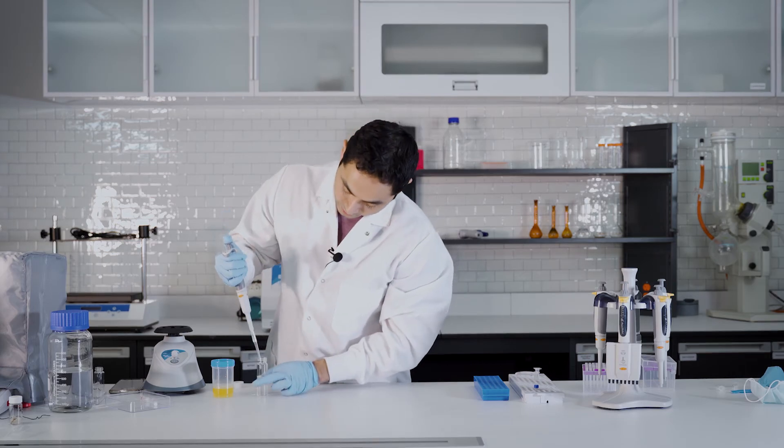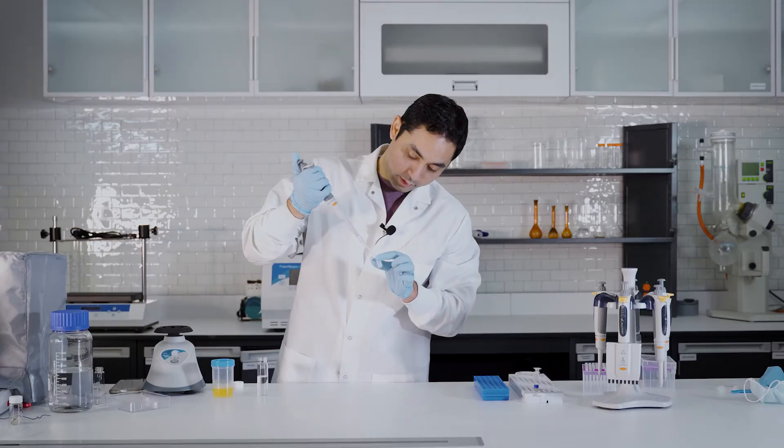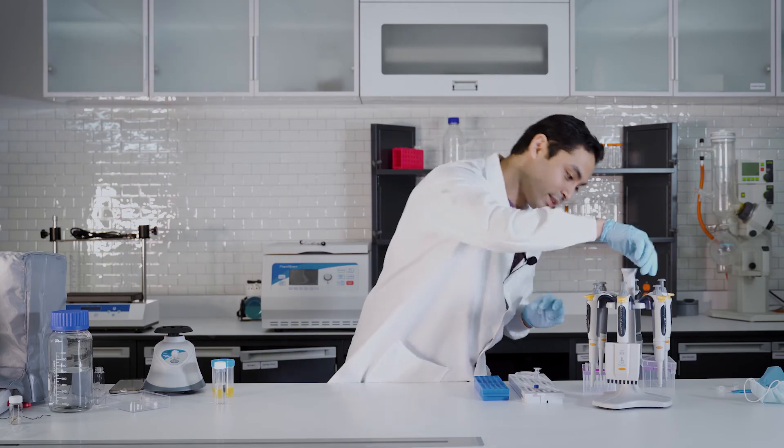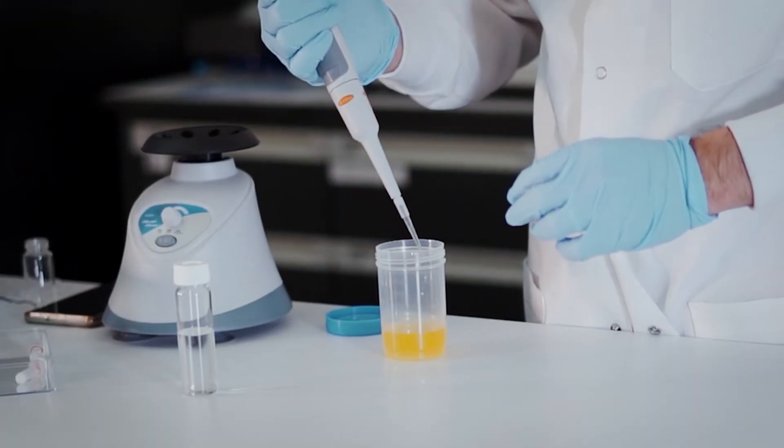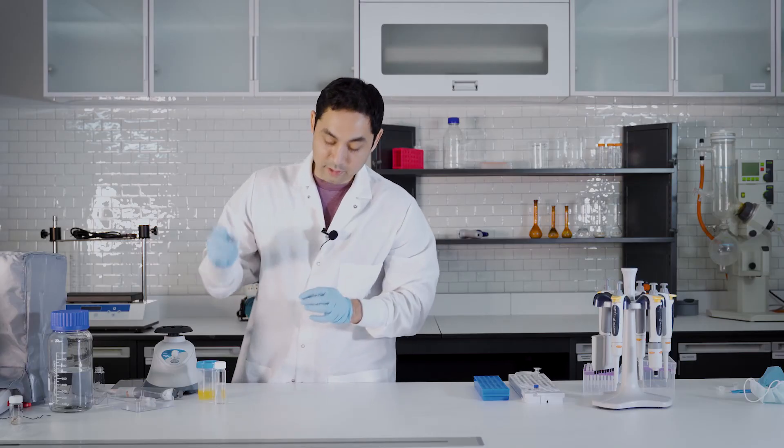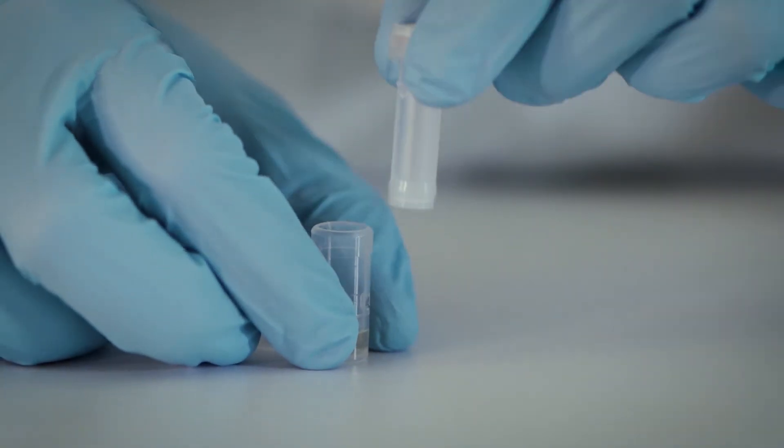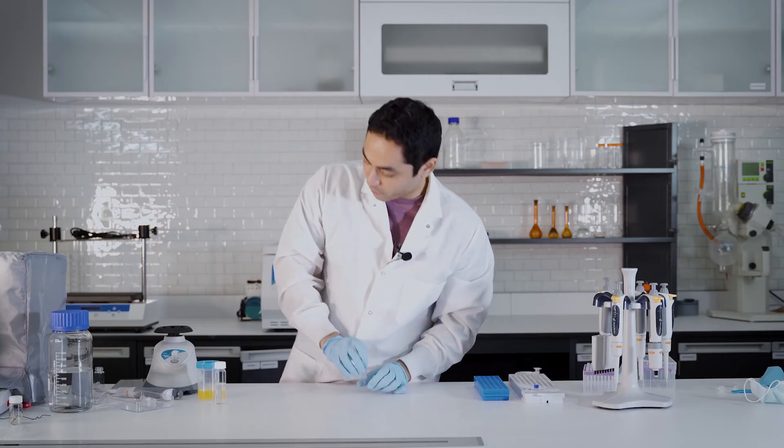All right let's pipette some acetonitrile in here. Let's pipette our sample. Now you put the plunger just part of the way down so we can vortex.